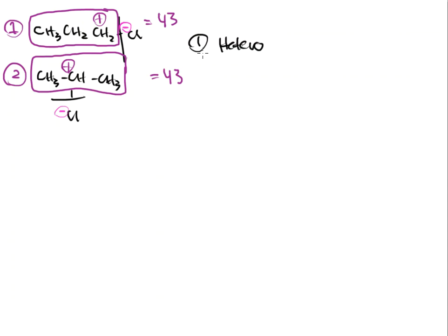Remember, these 2 molecules are identical with the same number of carbons, same number of hydrogens, same number of chlorines. The M peaks are going to be the same. If I do a formula weight for each one of those molecules, I get the same number. And now we understand that if we have a heterolytic cleavage and I chop the chlorines off and I leave behind these fragments that get analyzed on the mass spec, both of those fragments are 43. That means it can't use that to do its job either. So we've got to look at the other fragmentation patterns. That's why we have more than one fragment. We've got to analyze all of them.